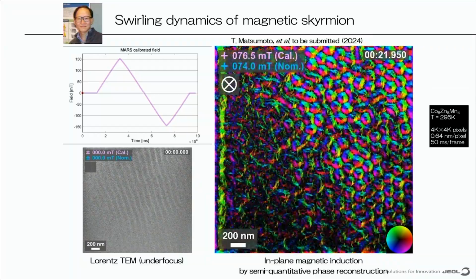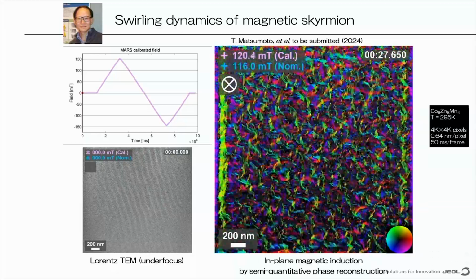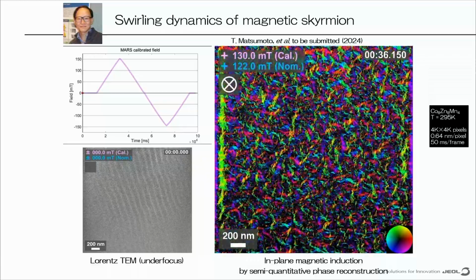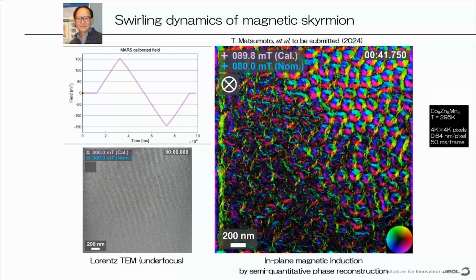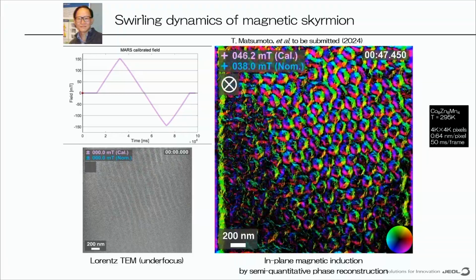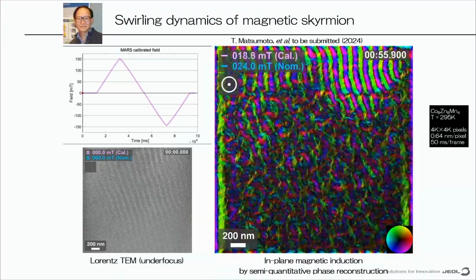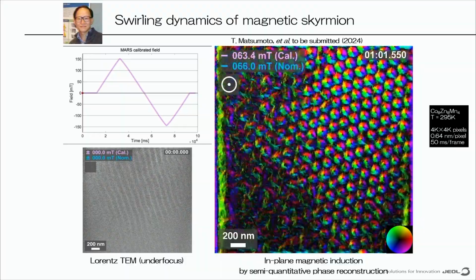and the domains change to a series of skyrmions. And you can see as the field gets too high, they disappear again. And then we start to bring the field back down. They return. And then once you go through the zero field point, they'll go back again to this helical structure. And then as you go back through and apply the field in the opposite direction, the skyrmions will reappear, but they're inverted. The field directions are completely changed.